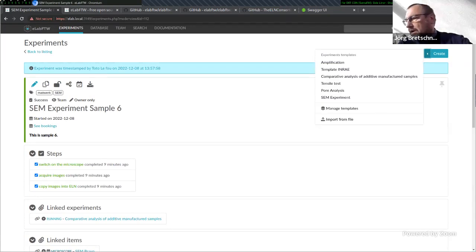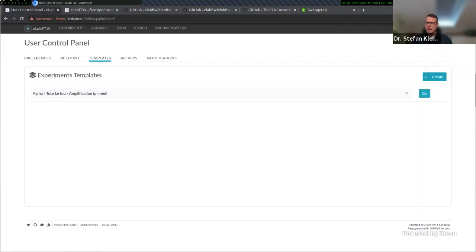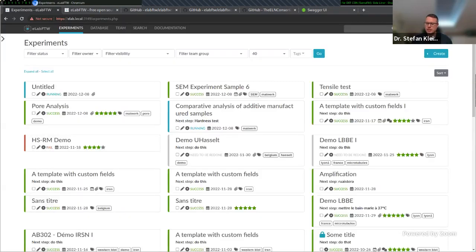Please ask questions, and Stefan, you manage. I can do so. I wait for the raised hands, and I wanted to give some further input. There are questions which we expect, for instance, where is data stored. My proposal is to wait with those questions and put them into the general discussion round, because they belong to each ELN. If you have a question specific to this ELN, please feel free, and you can forward the more general ones to the general discussion.